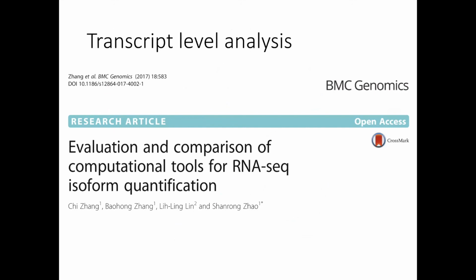And then, as you said, the absolute values are going to be different, but different transcripts are also going to show up in qPCR which cannot be seen in RNA-seq, which means the transcripts which do not have poly-A tails. Yeah. So do they just comment on the specific poly-A tail cDNA synthesis, or is it?